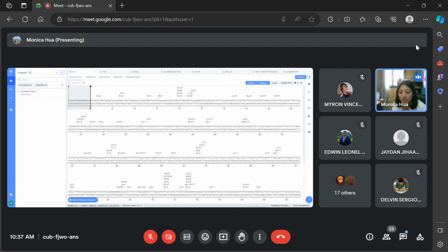When we talk about PCR, I'll let you know why. You right click this and press create primer. And there you go. You could click forward or reverse. You don't need to mirror image it or anything like that. But let's not create a primer.